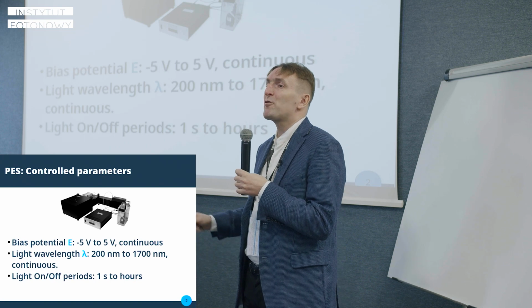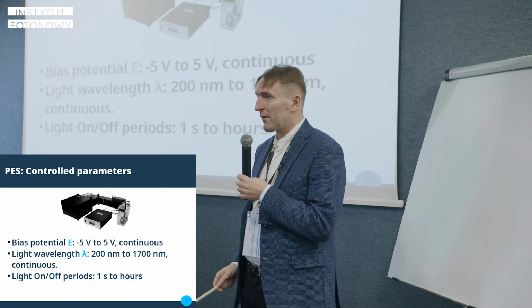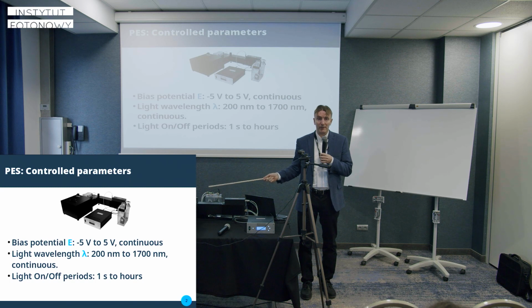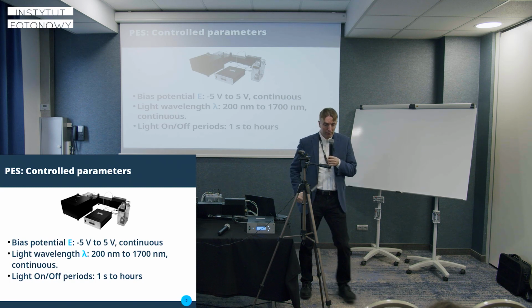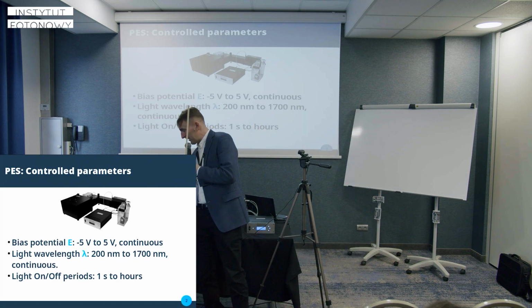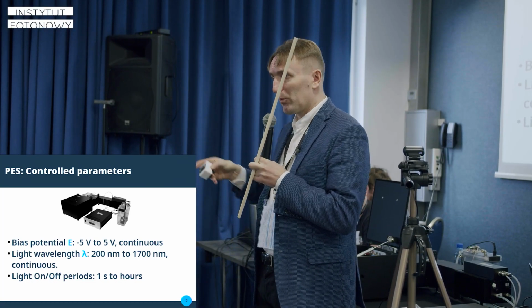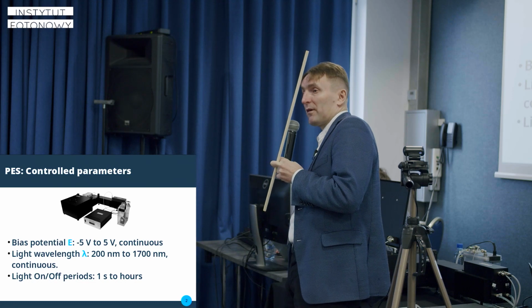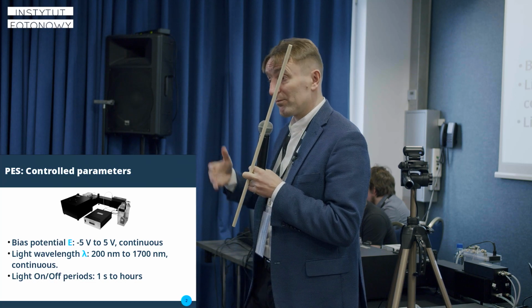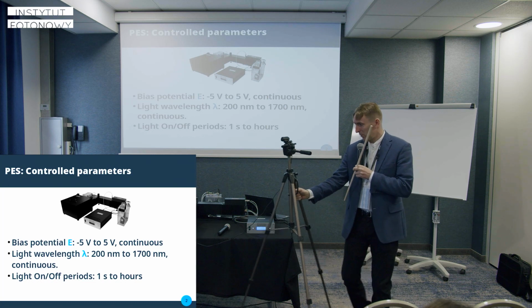There is an improvement over older designs. We can also deliver light directly to the sample, white light or standardized white light, so you can use it as a solar simulator. You place your sample inside, for example, by means of a cuvette. You attach your sample here, and you can measure both the response to monochromatic light and the response to standardized white light or sunlight. Okay, I will move this a little bit.